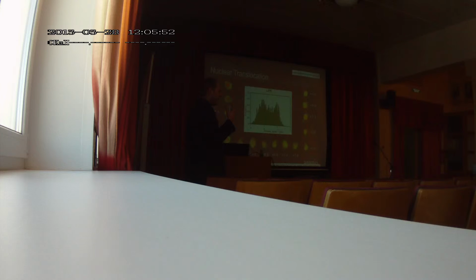But is there at the same time, in the same pixel, over about 500 pixels per cell, also high intensity of the nuclear factor kappa B staining? If yes, it results in a high similarity score. If no, it results in a negative similarity score. And you get such a profile, a histogram, but not based on just intensity, but on the comparison of intensities, in this case called similarity, an image-based feature.